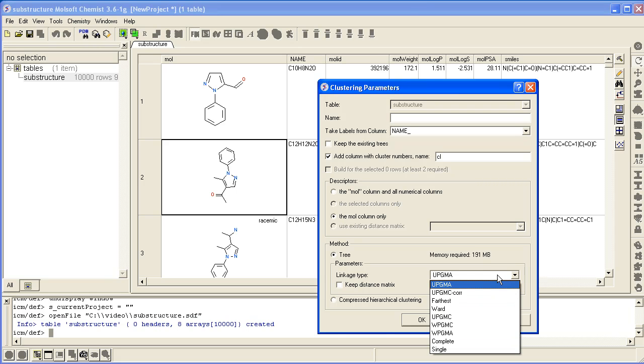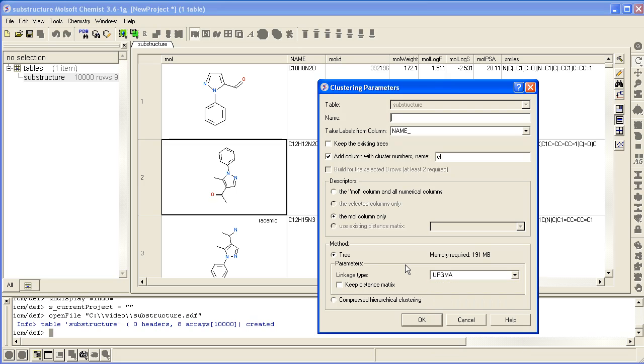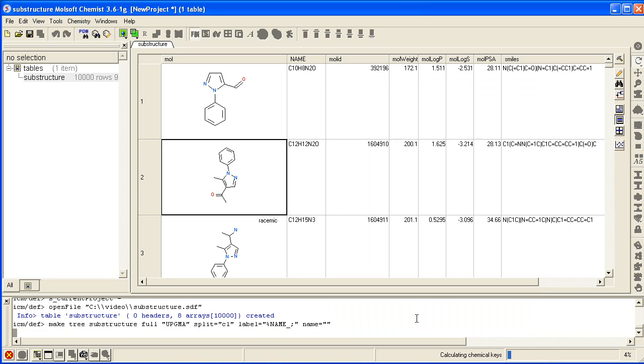Then we have a variety of linkage types, and press OK. Then you can see that the chemical clustering is being performed.